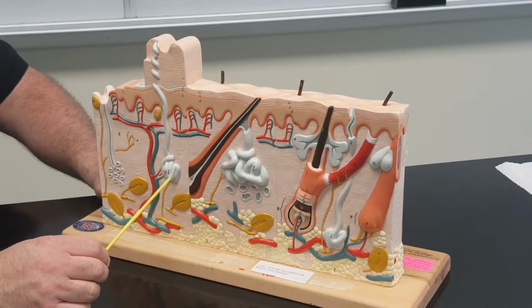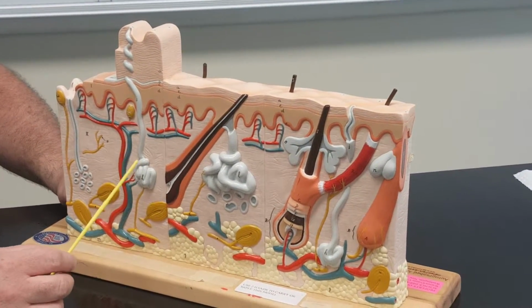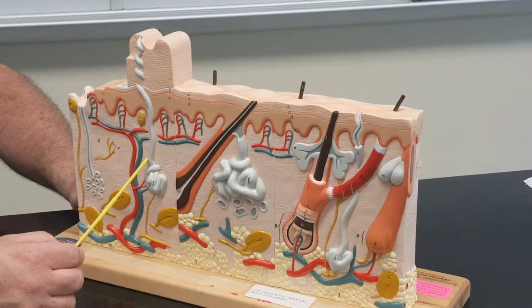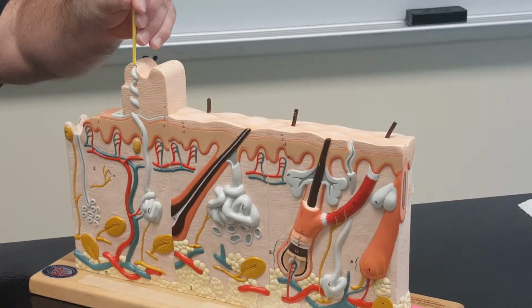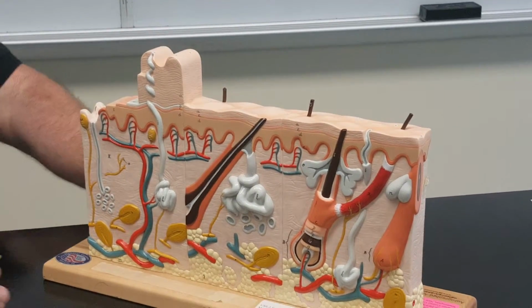Here you're going to see an example of a sweat gland that is a merocrine, aka eccrine sweat gland. You'll have the duct right here, and then the opening, the pore, sweat pore. Here's another sweat pore. Okay.